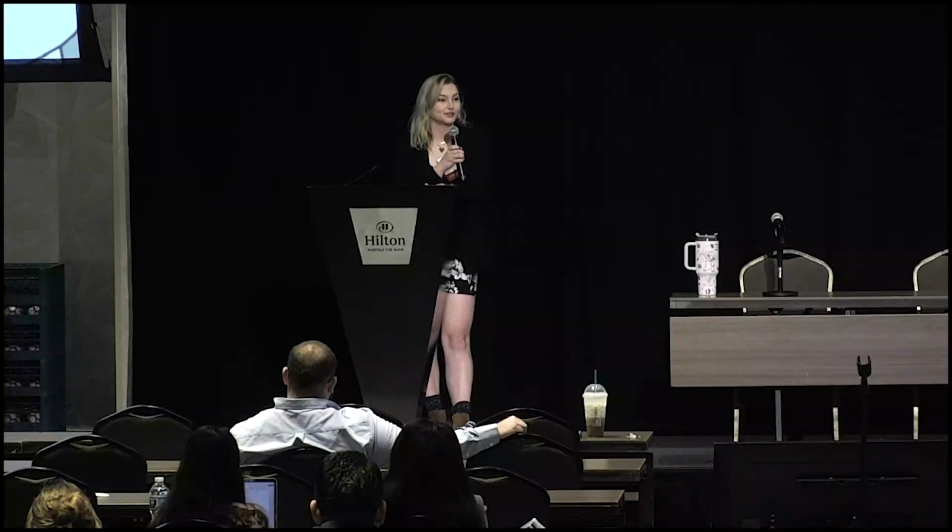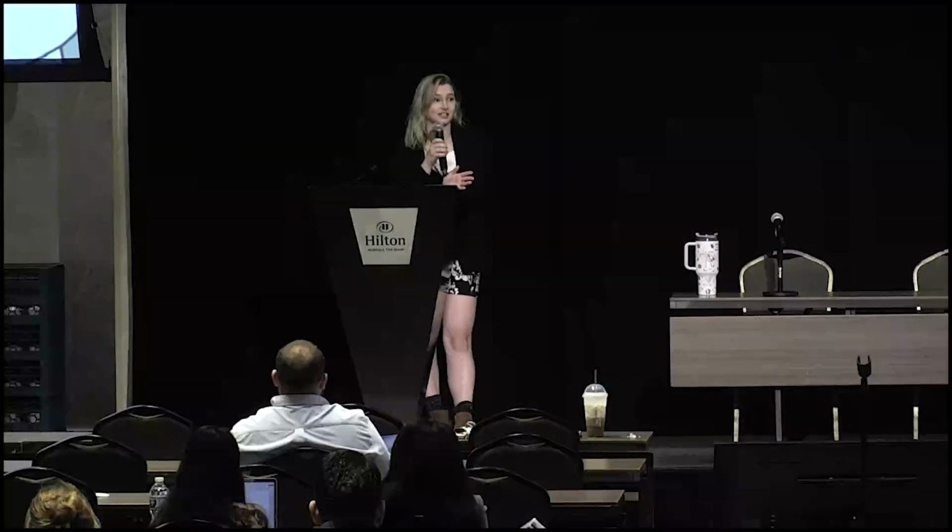So to address the first comment and also the first comment that was given after this presentation, I am aware that there are multiple expansions to these. Golden Braid has overcome many of the disadvantages that I've listed. However, I could not go over absolutely everything. So there's more listed on my little blog, but I just went over the first introduction of each of these platforms. If you are interested in one but you didn't like a particular disadvantage that I listed, it may be worth it to still look into it and see if more publications have come out on it. And to address your second point, I have only cloned it. I am still working on the plant transformation side.